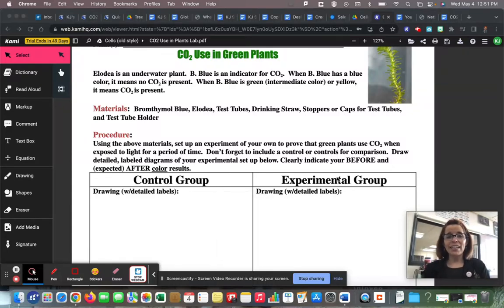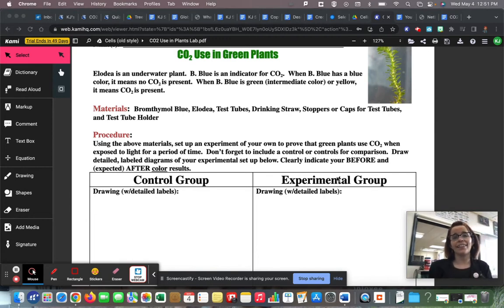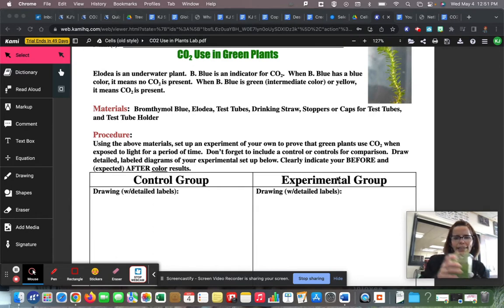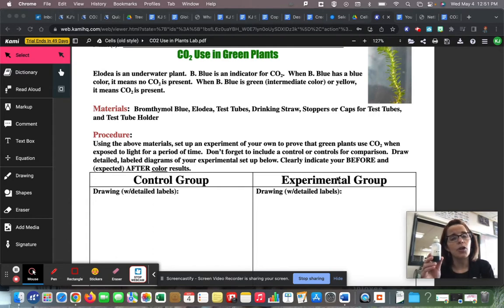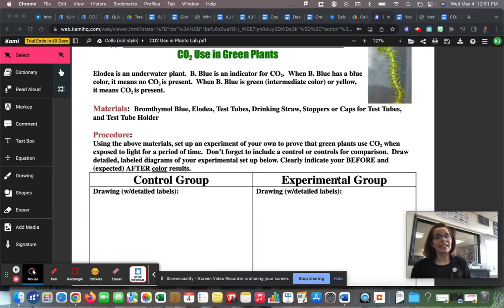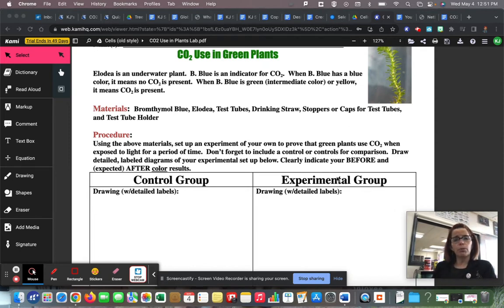Hello everybody. Today we're going to do the CO2 use in green plants lab. It says Elodea is an underwater plant. B-blue — bromthymol blue — is an indicator for carbon dioxide. When B-blue has a blue color, it means no carbon dioxide is present. When B-blue is green, which is considered an intermediate color, or yellow, it means carbon dioxide is present. We're going to use those materials today to try to prove that carbon dioxide gets sucked up by plants.